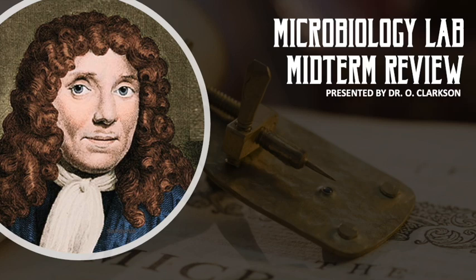It didn't really grow. It didn't really take. It didn't really grow in the medium. That sediment is just bacteria that didn't really make it effectively. Yeah, so that means that there's no growth, really. Yeah, no growth. In terms of microscopy, what are the two most important things in microscopy?